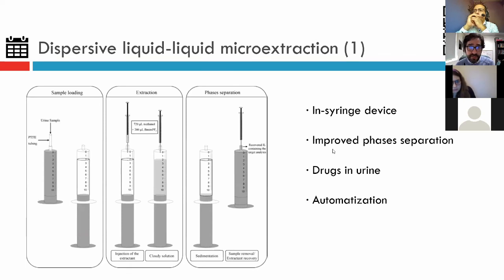I think that the question was related to this procedure, liquid microextraction, and the kinetics of this procedure. Yes. So the process is very rapid. We have observed that if we study, for example, how the signal increases with the extraction time, 1 minute is enough to achieve the highest signal.